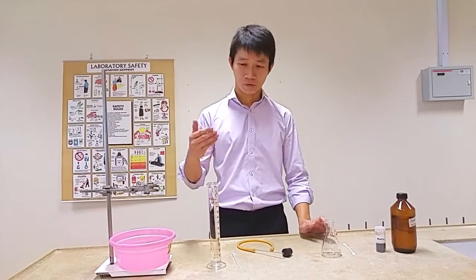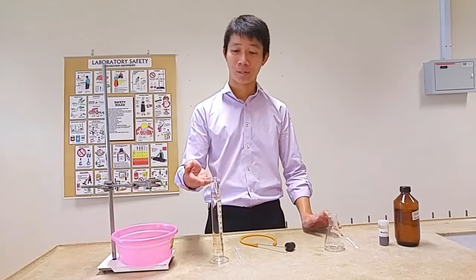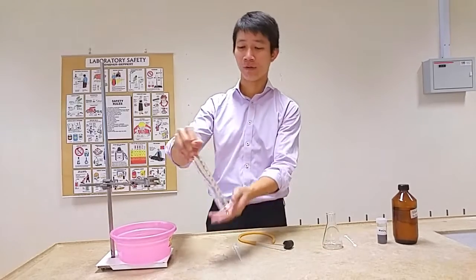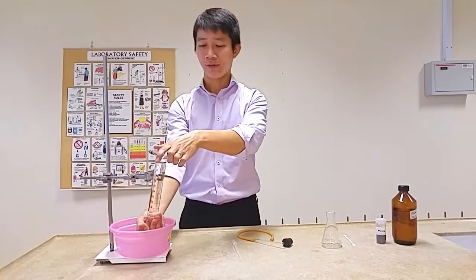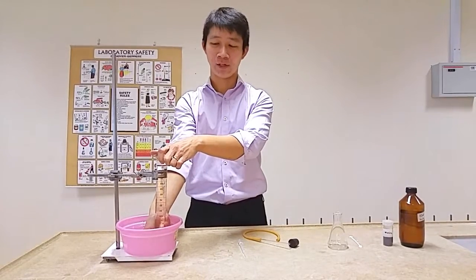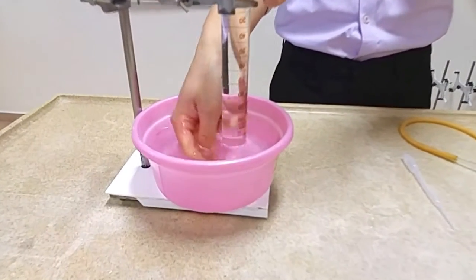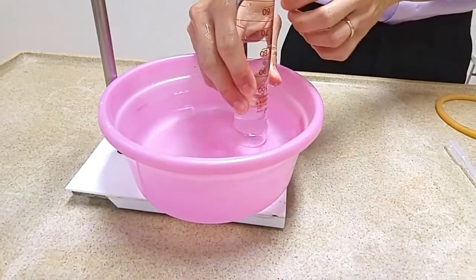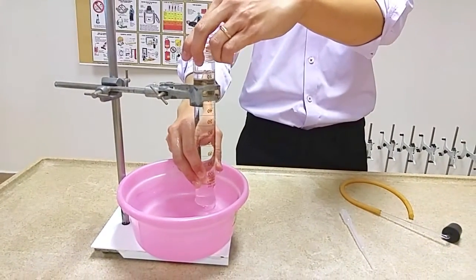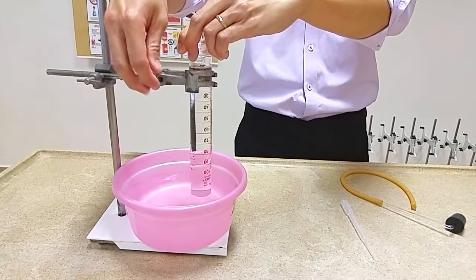First, fill up the measuring cylinder with water to the top. Then place a hand over the measuring cylinder, invert it, and put it into the basin of water. Make sure that the mouth of the measuring cylinder is fully immersed in the basin such that water will not flow out. Adjust the measuring cylinder so you can see the markings to take readings later, and clamp it tight.